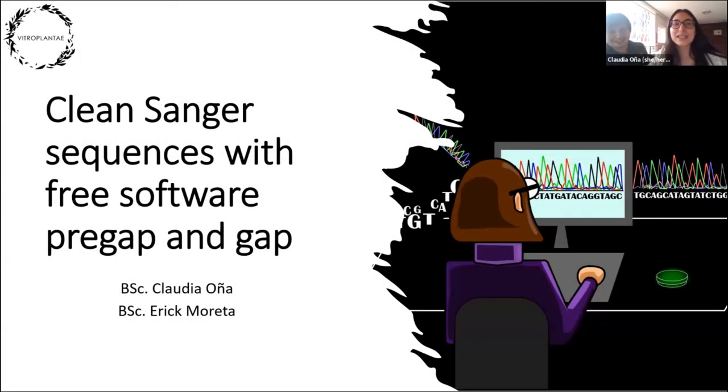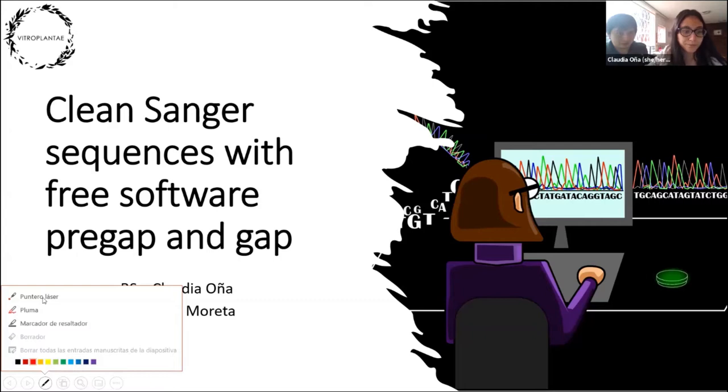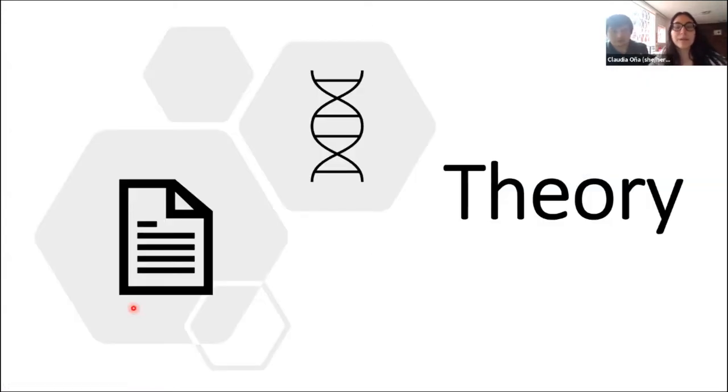And as the title says, we are going to learn how to clean Sanger sequences with the free software Pregap and Gap. So let's go. This workshop has the theory part and the workshop itself. So let's go with the theory first.